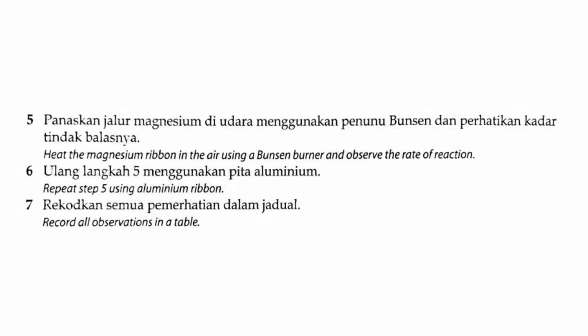Heat the magnesium ribbon in the air using a Bunsen burner and observe the rate of reaction. Repeat step 5 using aluminium ribbon. Record all observations in a table.